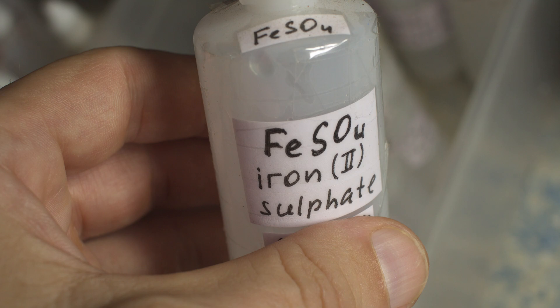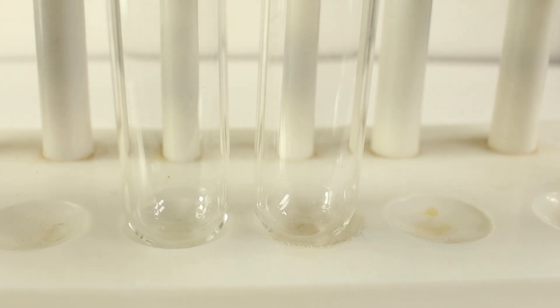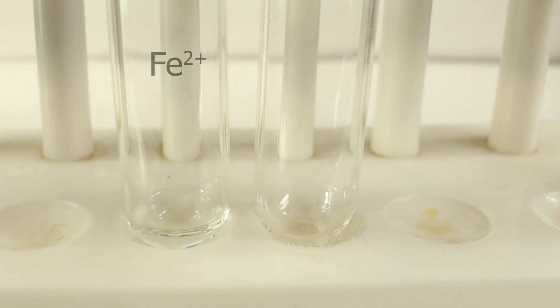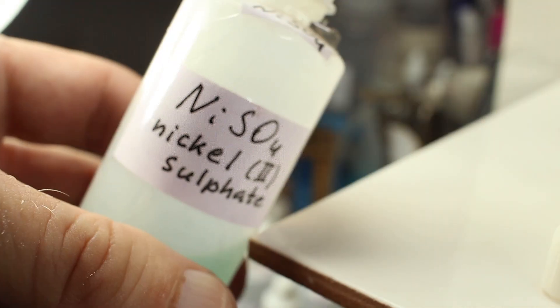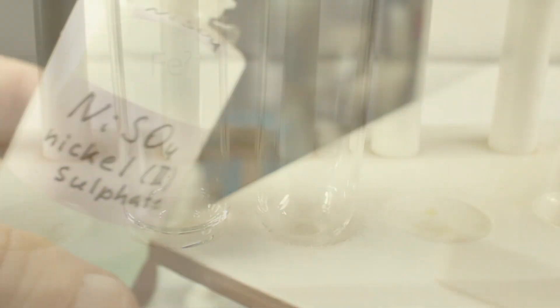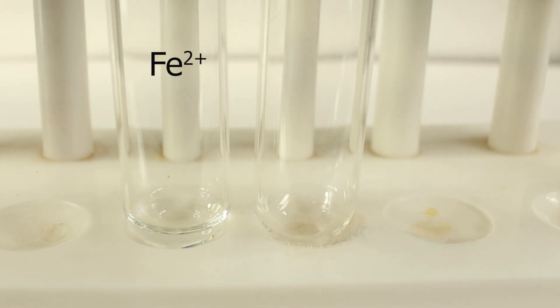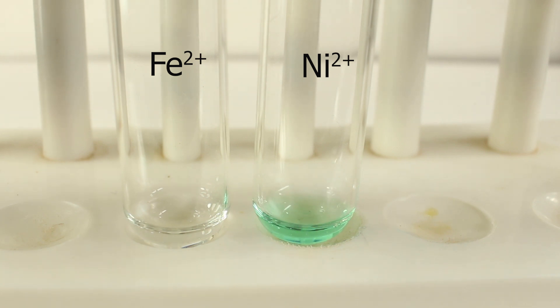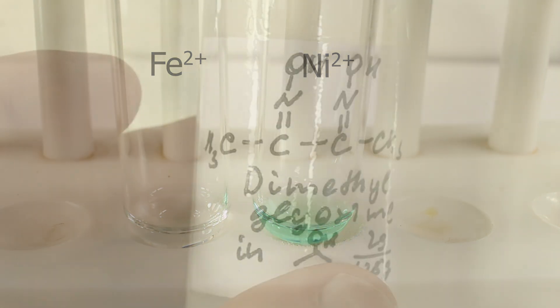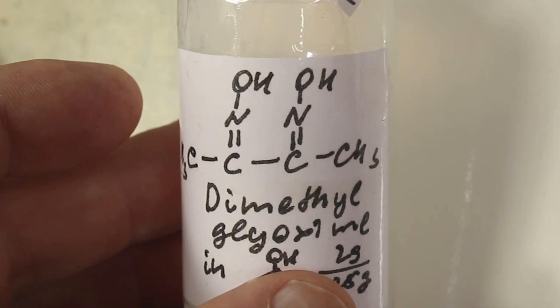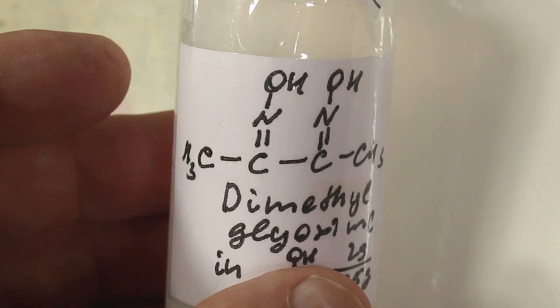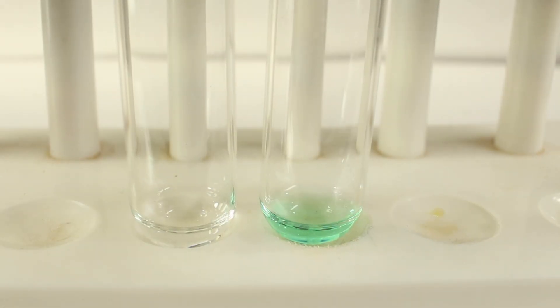As my control I use iron-2-sulfate, which is also a green solution. And nickel-2-sulfate as the substance which is supposed to give a positive result. Dimethylglyoxime is a white organic solid which is soluble in alcohols. Here I use a solution of dimethylglyoxime in propan-2-ol, about 2 grams in 125 grams of propan-2-ol.